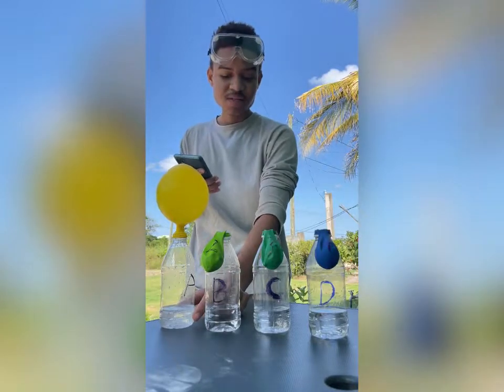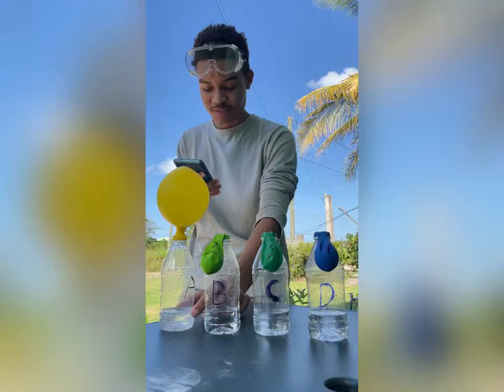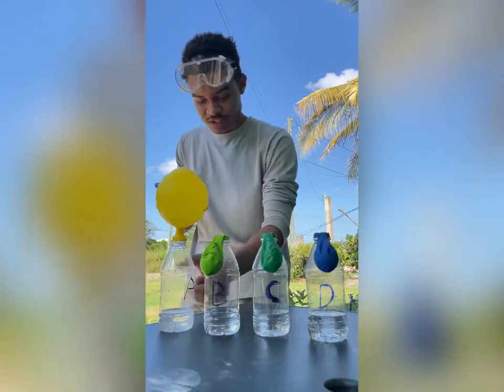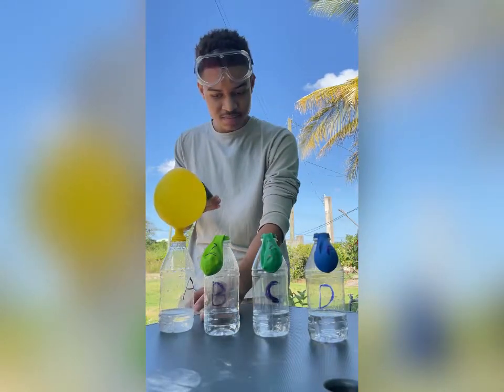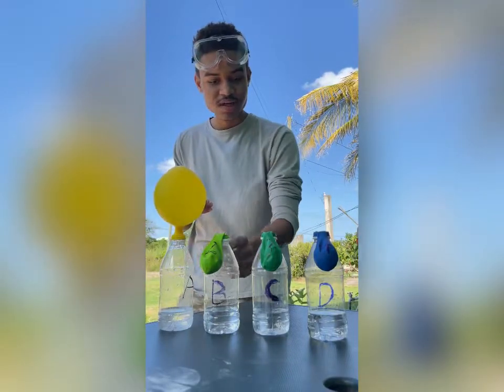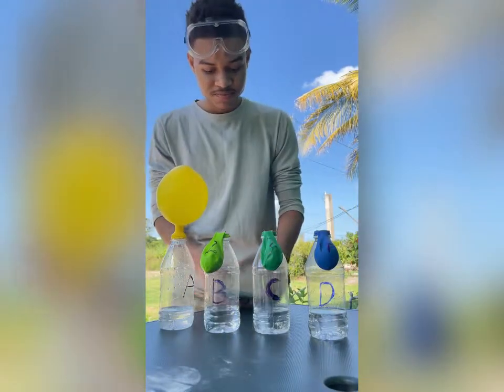Then, since the carbonic acid was unstable, it rapidly underwent a decomposition reaction. This formed the carbon dioxide, which is in here, and water, which is on the sides. So the carbon dioxide escaped this solution as bubbles, and we can expect the same process to happen for all 4, but we have yet to see how much gas will be produced.